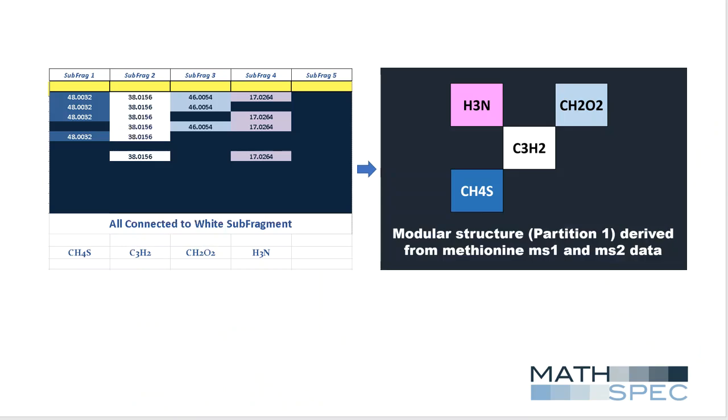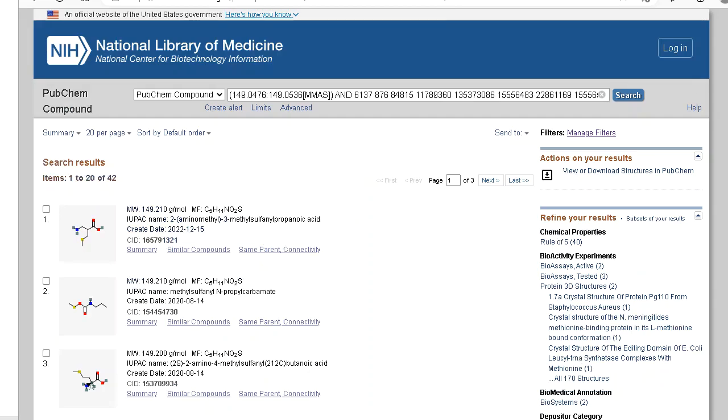We can further screen these compounds and eliminate all compounds that have an unlikely alignment. The first compound in the listing has each of the three outside subformulas attached to a different carbon of the C3H2 subformula. This compound would be consistent with the mass spectral data, so I can check that off.